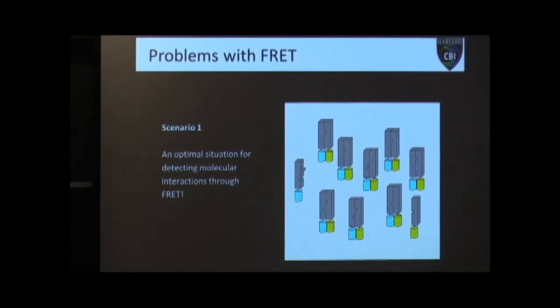Okay, so earlier on, I mentioned that there are a number of problems with FRET, and oftentimes I don't recommend it as a method to use in the facility. So I just want to take you through some of those problems that can occur and why FLIM-FRET is a method to get around some of these.